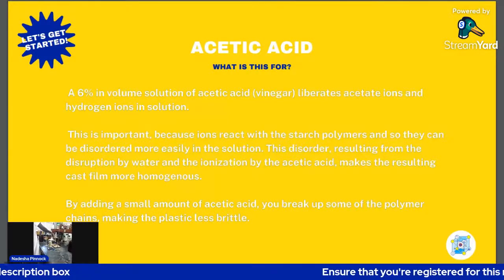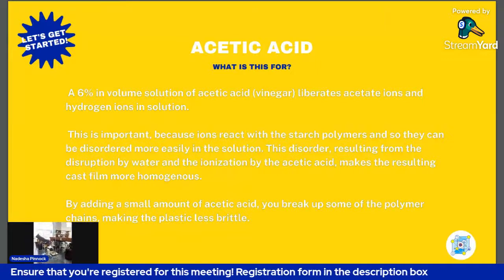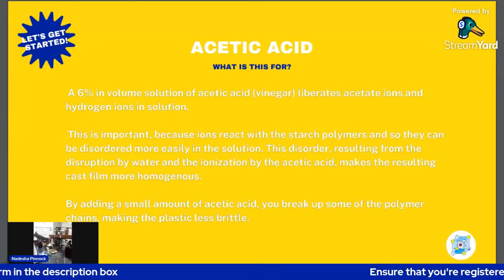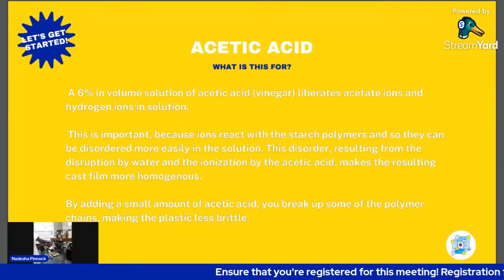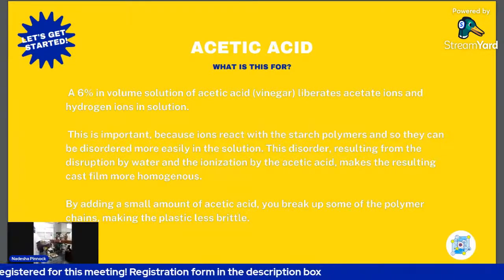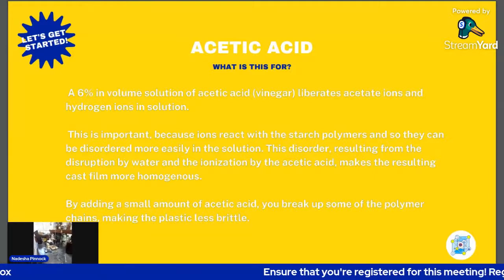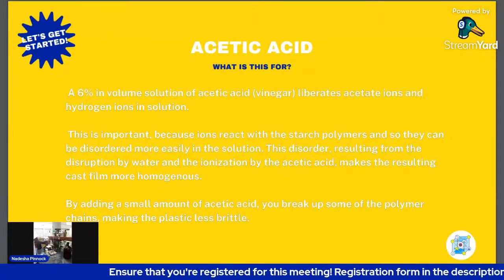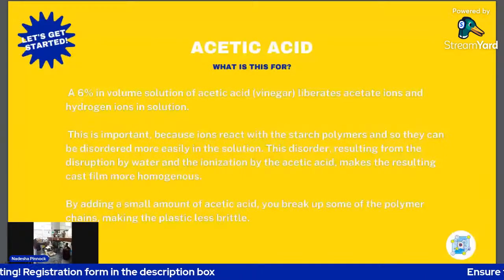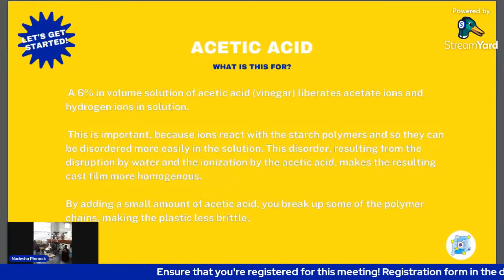With our acetic acid, why do we add this? So acetic acid, which is really vinegar, especially at a concentration of 6%, that's really just vinegar that you can buy. It liberates acetate ions and hydrogen ions in solution, which would be protons. And these ions react with the starch polymers, so they can be disordered more easily in solution. So the disorder is resulting from disruption by water and the ionization of the acid. And really what this does is to make the film more even or more homogeneous.